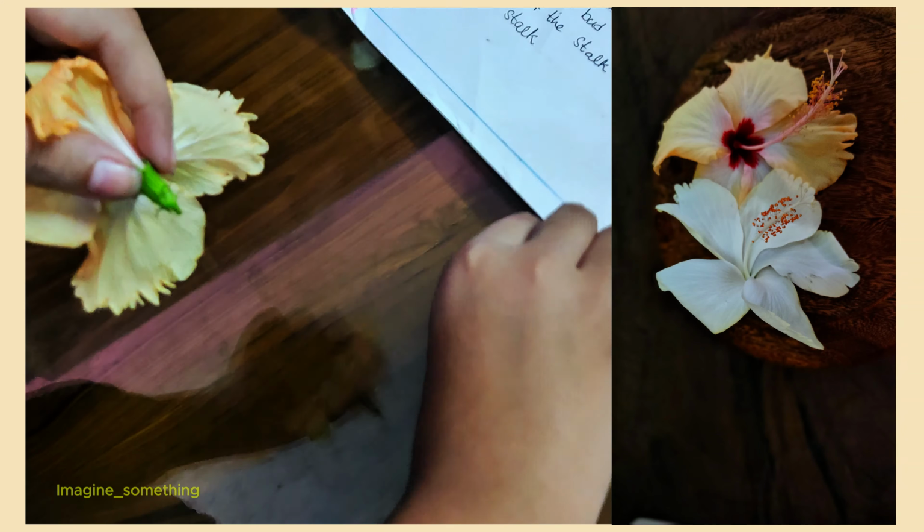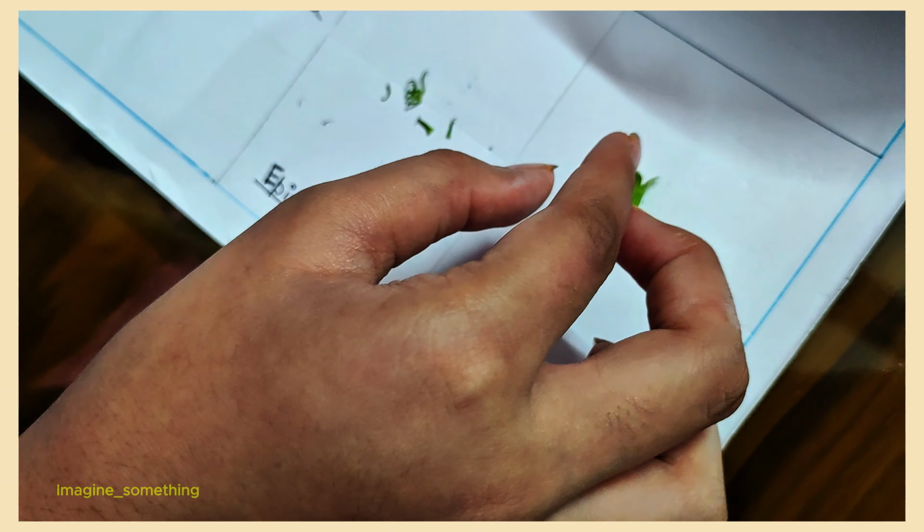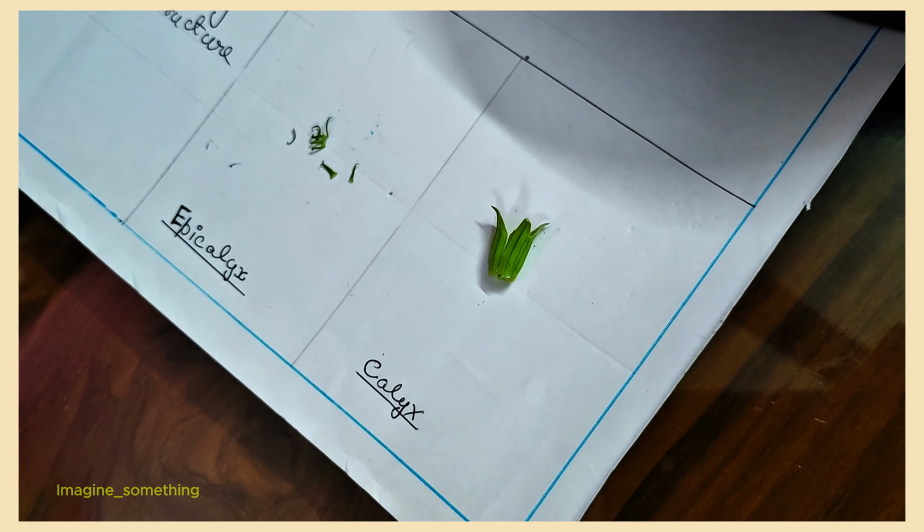If we see this flower, these are the epicalyx. The calyx protects the inner whorls of the flower in the bud stage. Now slowly peel off the epicalyx. Now I am going to separate the calyx from the bottom and make sure that we don't hold the flower by the stalk because that will break away the inner parts.